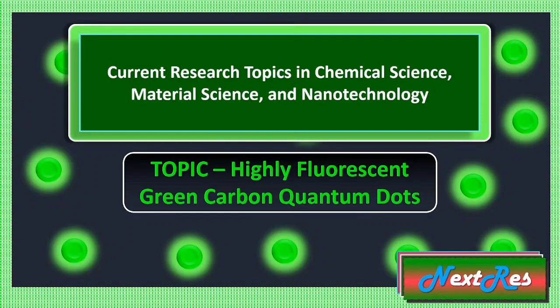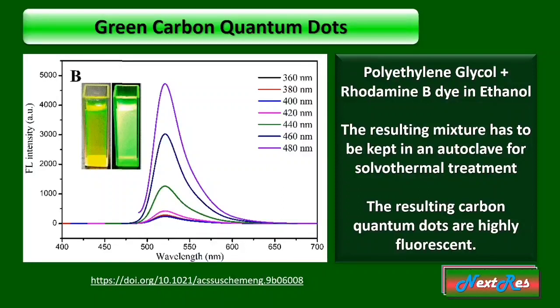While doing the literature survey, one would find numerous synthesis procedures for the synthesis of carbon quantum dots. Today I will tell you two highly efficient methods that could easily be used for the fabrication of very highly fluorescent green carbon quantum dots.